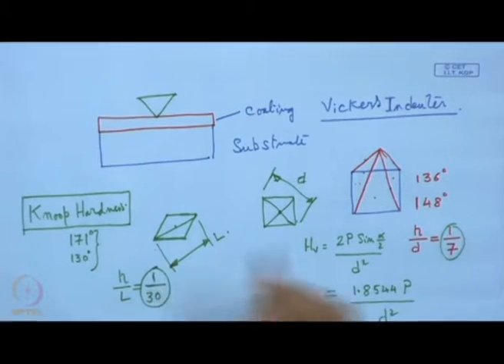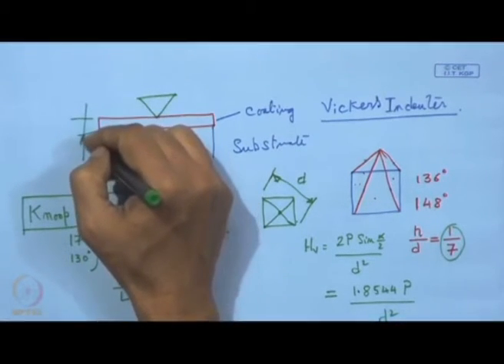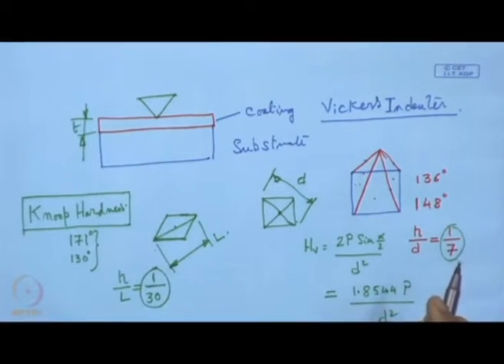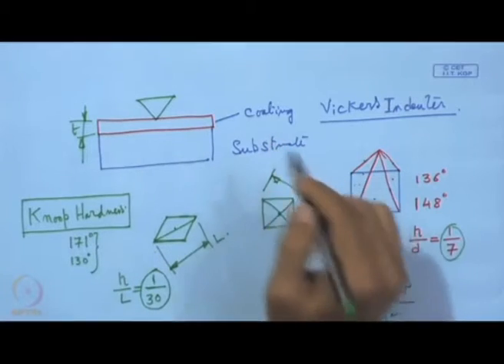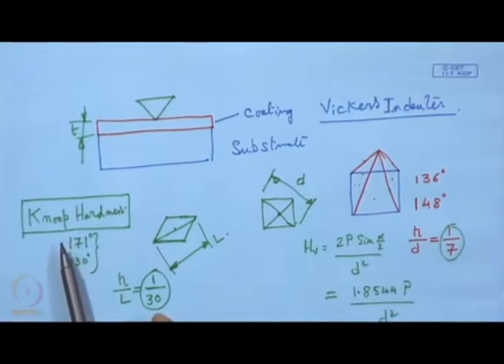What we can see is that penetration depth is less with the same load. So, it would be advantageous in measuring the hardness of the coating whose thickness is also specified. So, this is one consideration one can make while measuring the surface hardness of the coating, either with this Knoop hardness or Vickers indenter, but here this will be the first choice.